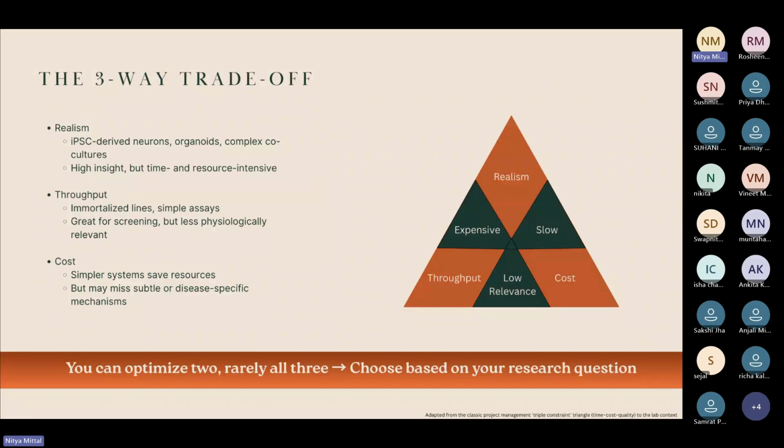So once you have designed a disease model, you have to think about what assays you can include in your experiment. You can think about this triangle and it helps you be like a guiding light. Okay, this assay is possible or this assay is not possible.